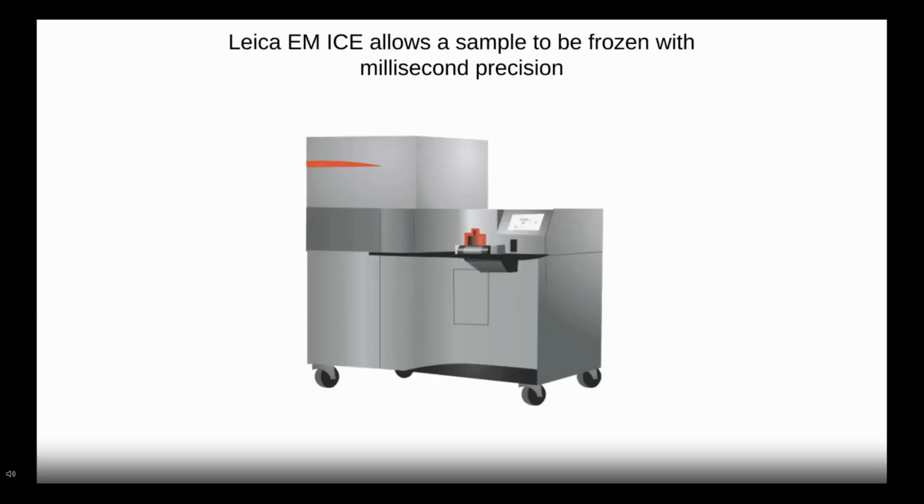In principle with high pressure freezing, this is very possible because it intrinsically has to be a fast process. That's part of how you get your beautiful structure preserved. With the Leica EM ICE, the current instrument that we use, your actual control of freezing is down to the millisecond. So high pressure freezing, in addition to giving you native structure, gives you some of that temporal precision by itself. The next thing you need to look at these synaptic processes is a way to precisely stimulate the cells, to couple that stimulation, the induction of action potentials and activity, with your freezing.